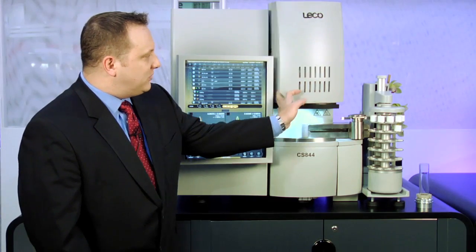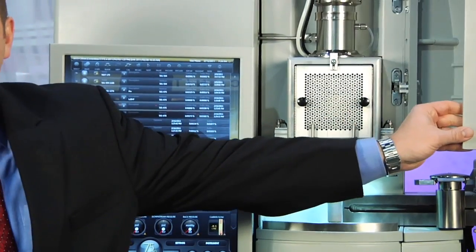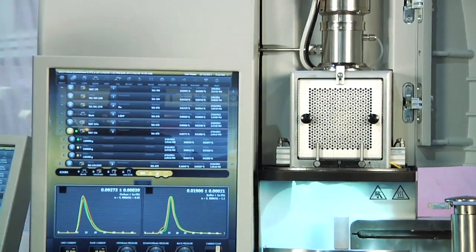Some of the other features of the system revolve around our high efficiency furnace. The first of which is an automatic tube exchange system.